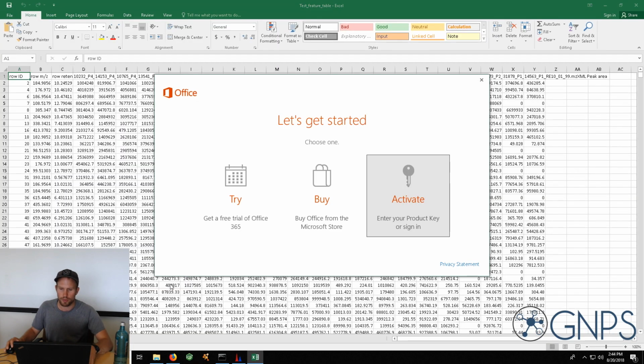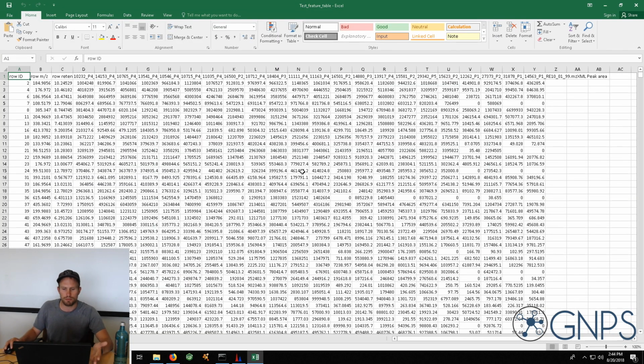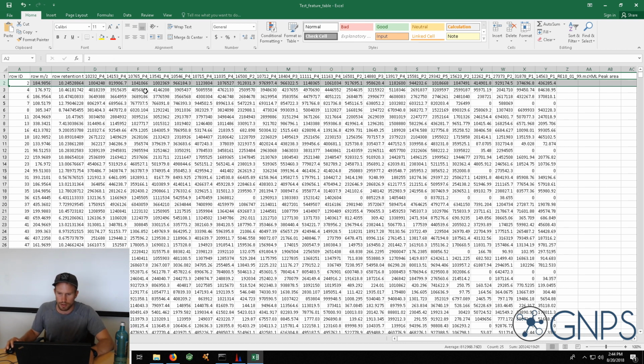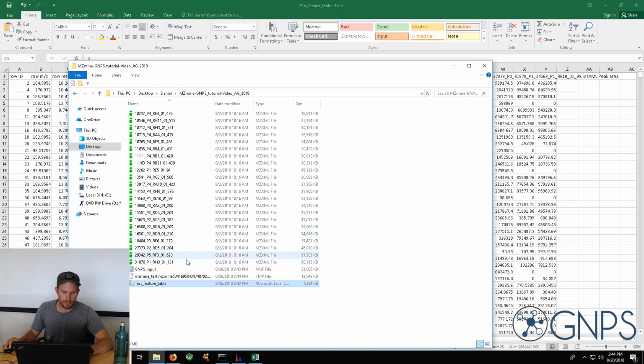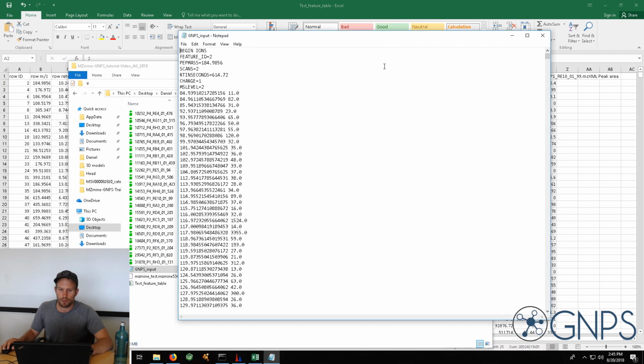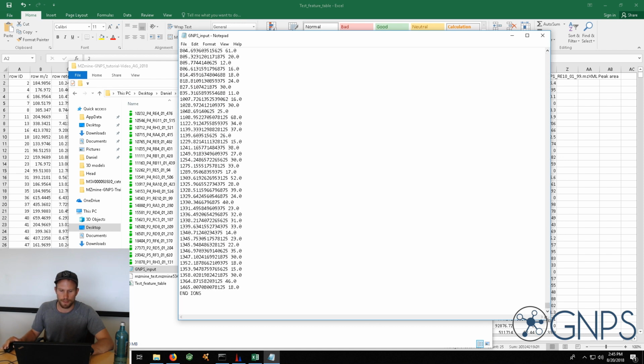And in this CSV file, we basically have the information from the matrix you saw already in MZmine. For example, here, feature 2 with the mass 184 and the retention time of 10.2 minutes, and then peak areas for each of the different samples. So now, matching to those numbers, when I open the MGF file, you can see I get all the MS2 information, and here feature number 2 would have the parent mass of 184, and so on. I got this for all the features.